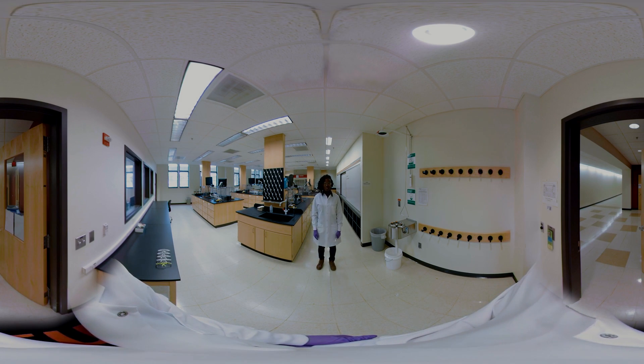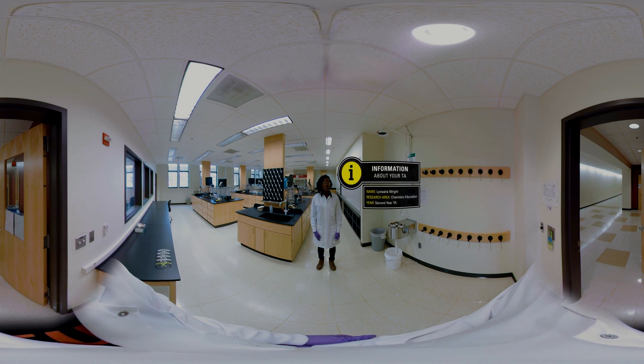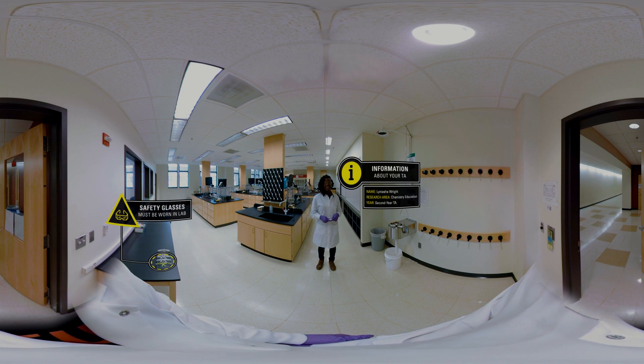Hi, welcome to Organic Chemistry Lab. My name is Lanisha and I'll be your TA. Today we'll be learning about thin layer chromatography. So please grab a pair of safety glasses on the table to your left, put them on, and we'll go ahead and get started.